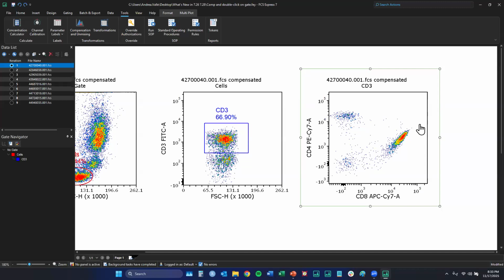So I won't do it. If there is anything wrong with the compensation, it's because either the sample or the control or the fluorochrome or the staining has not been done properly. So yeah, I think we are on the same page. Thanks for asking.